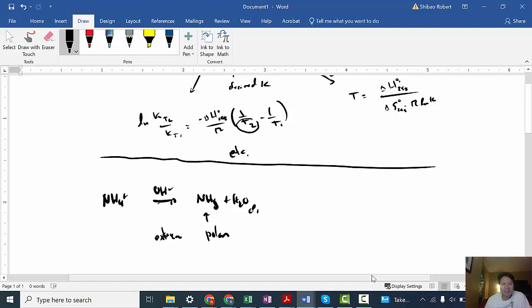Okay, but the ammonia here that's formed is going to be in the aqueous state, and so it's hard to detect sometimes. But since we're adding strong base here, it could have contaminated the solution. So pH isn't going to tell us alone. What we're going to do here is we're going to heat it, and so what we're trying to accomplish with the heating is to drive the ammonia out of solution into the gas phase, and then test the gas for acid-base properties.